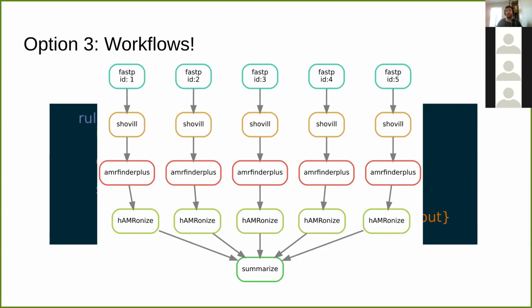But even if you're running it on your own computer, you can fire it across your processors, give it as many cores as you want, and it'll do it in parallel and use your computing resources efficiently. And there is a very simple, basic Snakemake workflow implementation for these tools that you can find in that repository. Part of the slide didn't load.